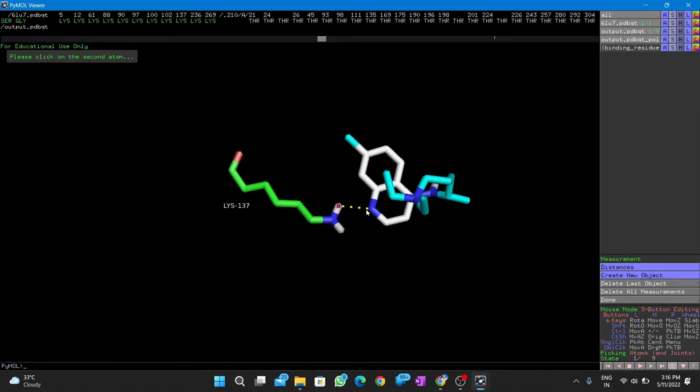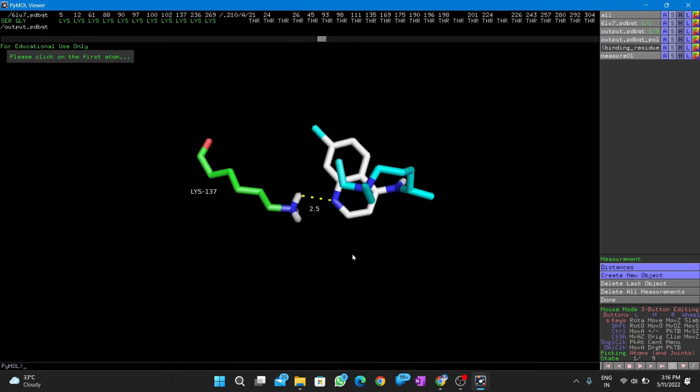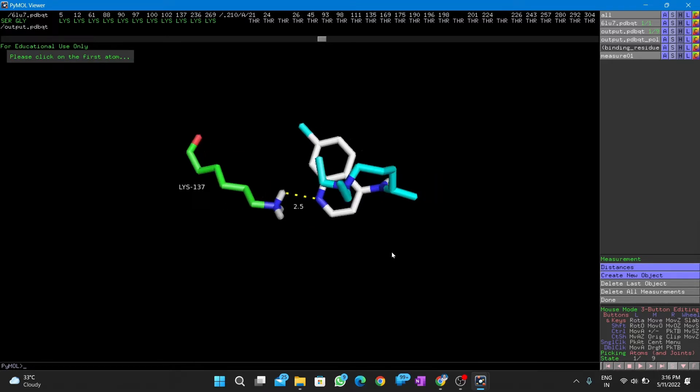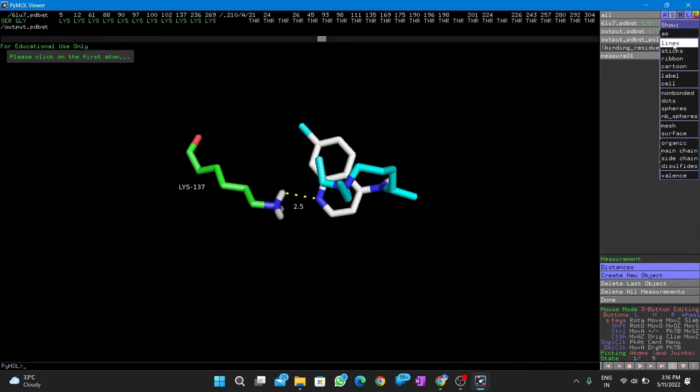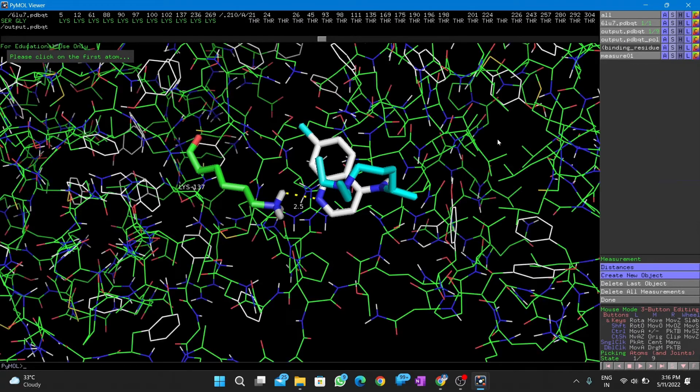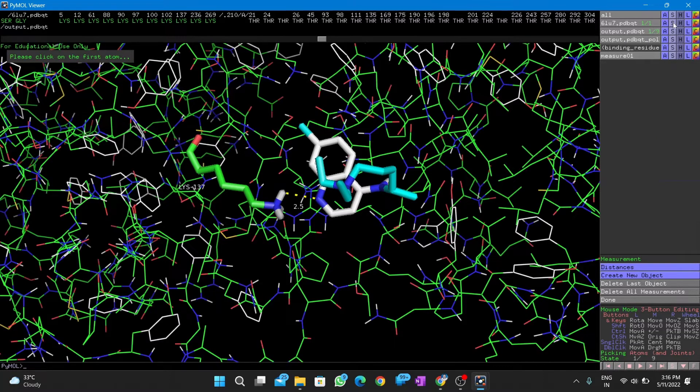You can also change colors if necessary. Looks fantastic.